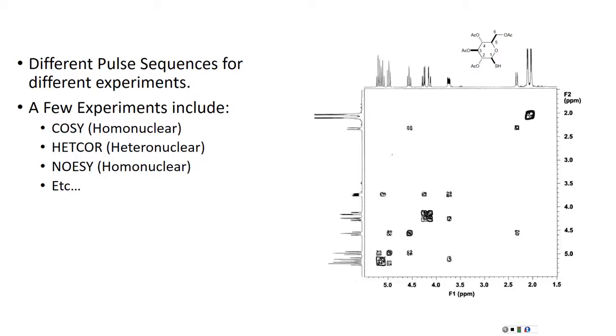I missed how, so you run NMR and you want to know what's in your sample, right? Yes. Okay, so don't you need some data from beforehand? Like, oh, this peak corresponds to a methyl group, this OH group, this. Yeah. You do have generally known tables.